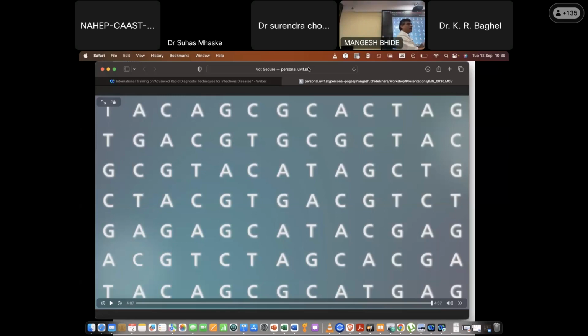It will not just add adenine again, but some adenines are not included. So in sequencing, those adenines you will not see. So only in these stretches will you have some missing nucleotides, but the rest is fine.